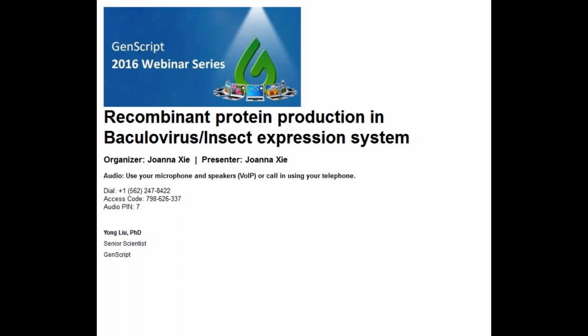Lastly, cell viability is important for good expression of your protein of interest. You should refresh the cells with fresh seeds at least every 4 to 6 months. The third point is, what can we do with this powerful expression system? Let's take a look at some of the published case studies and some of our own in-house case studies.